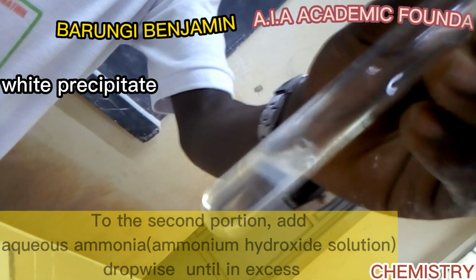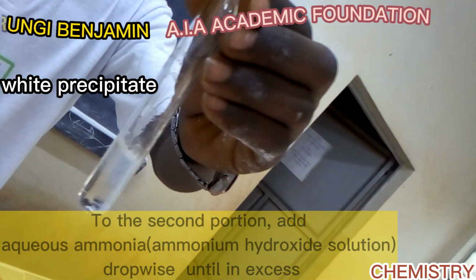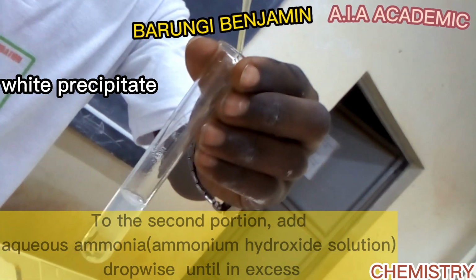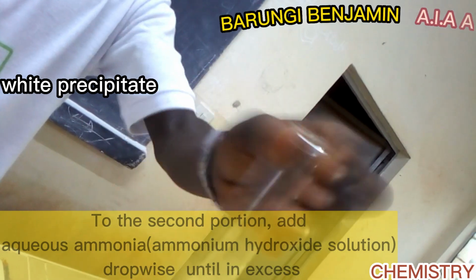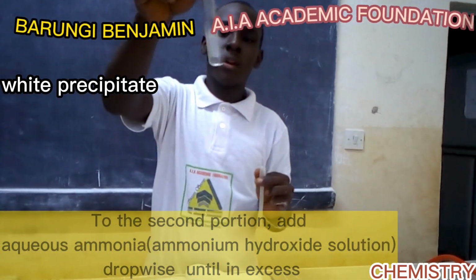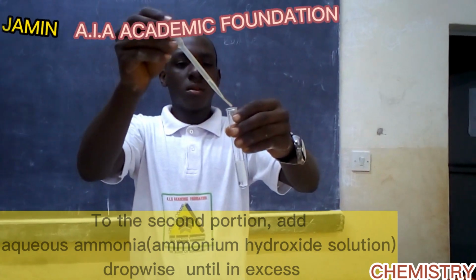As you see, there are some precipitates being formed and they are white. As you can see, we are obtaining white precipitates. The white precipitates are forming, so we should add until in excess, until we see no observable change.